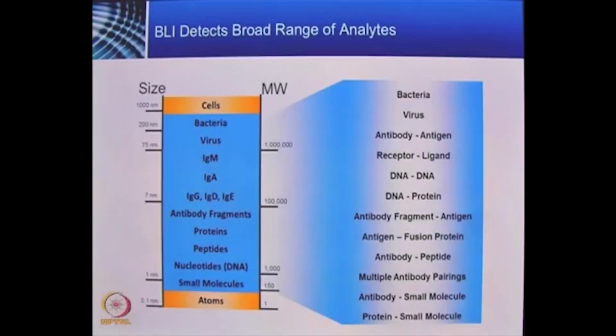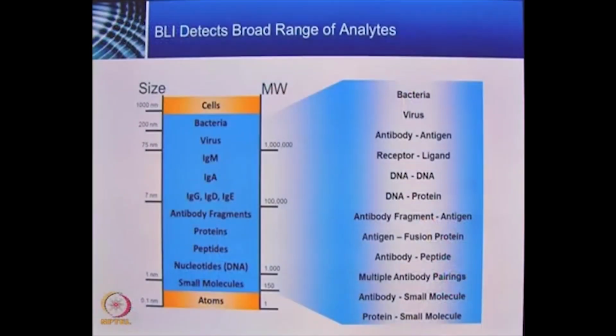to analyze the interactions between biomolecules, from molecules down to 150 Dalton, to antibody, to recombinant protein, to virus, and to bacteria. However, this system may not work directly with intact mammalian cells because the size of the cells has exceeded the limit of detection. And as another application, the BLI technology can work with different research purposes.